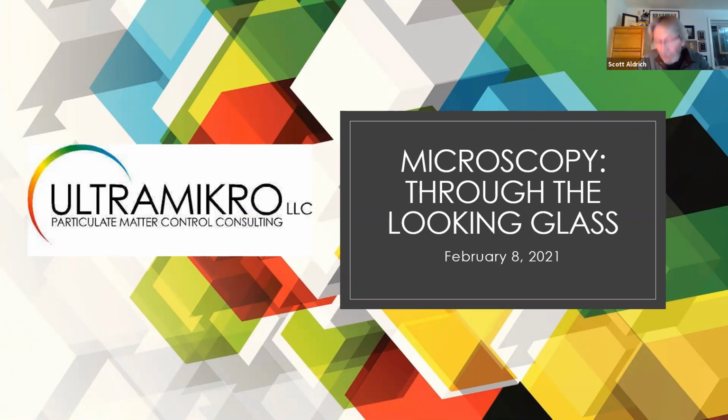As Shirley mentioned, I was a particle hunter, and that turned into more of a stability seeker as well. So we used all sorts of microscopy in the industry to first look at contamination, and then to look at products on stability, and to look at products as the customer received them. Sometimes that wasn't very welcome because we'd find things, but hey, we're there to make sterile and stable products to benefit everybody. So it all works out in the end.